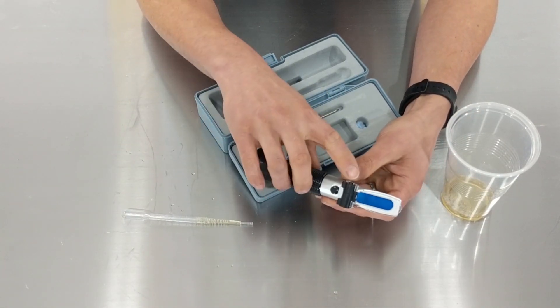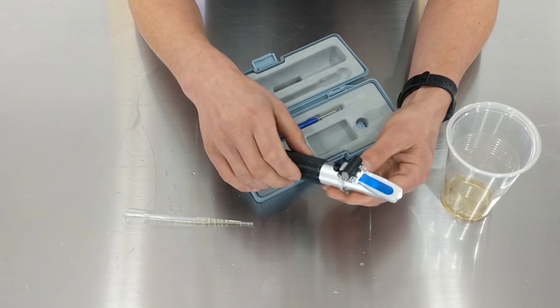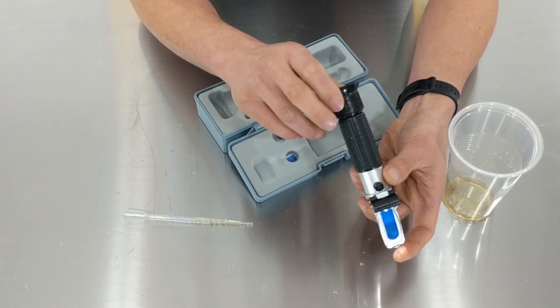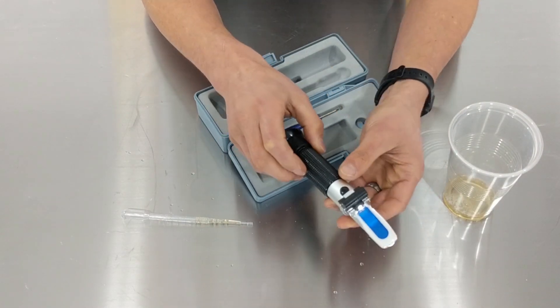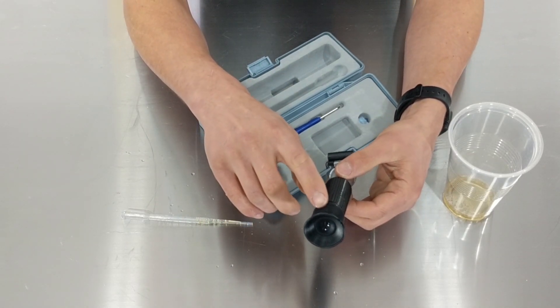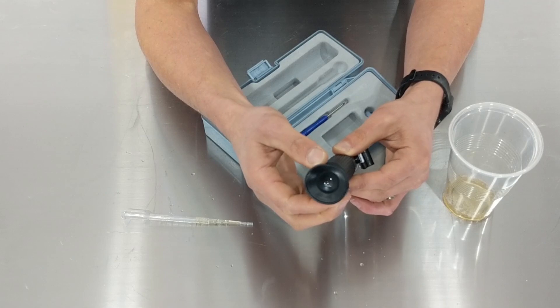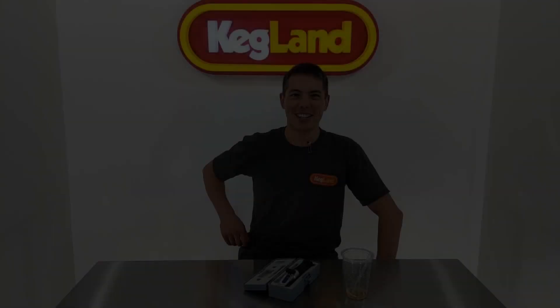I'm indoors so I'm going to use the LED light. There's so much ambient light from the studio lights that you may not see the LED illuminate, but I've just shut the lens making sure there are no bubbles underneath. Now looking through the lens — boom, I'm getting pretty much right on 1.023. If you get a slightly out-of-focus image, just adjust this dial here to bring the focus in tight. And that's pretty much it.